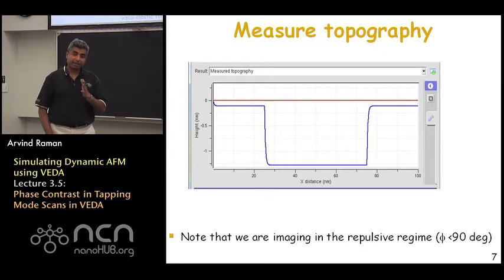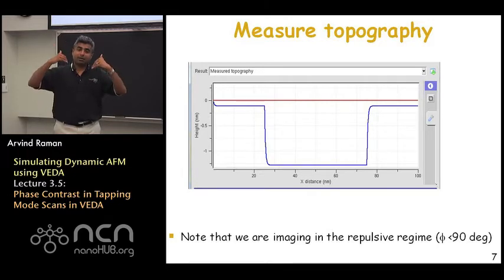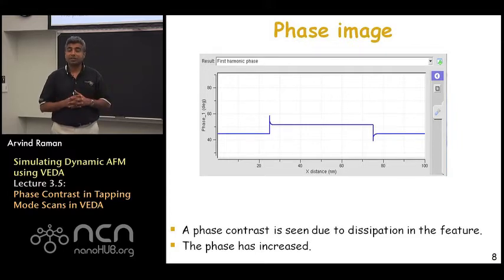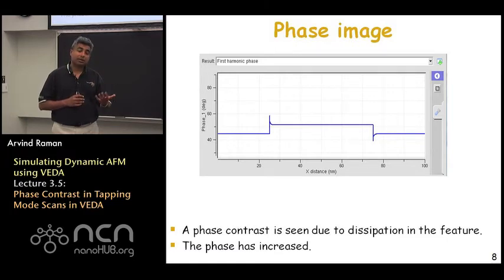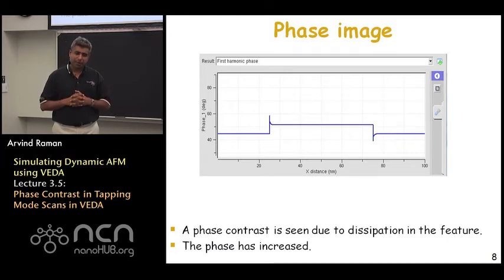With the imaging conditions shown in the appendix, when we plot the topography in blue, instead of being flat as expected, the soft feature appears depressed by about a nanometer and a half compared to the substrate. When we plot the phase, we find again that all of the phase is basically below ninety degrees, meaning both the substrate and the feature are in the repulsive regime of imaging. But we find that the phase lag is now greater on the feature compared to the substrate, which suggests more dissipation on the feature — confirming the theory that in the repulsive regime, greater phase lag corresponds to more energy dissipation.